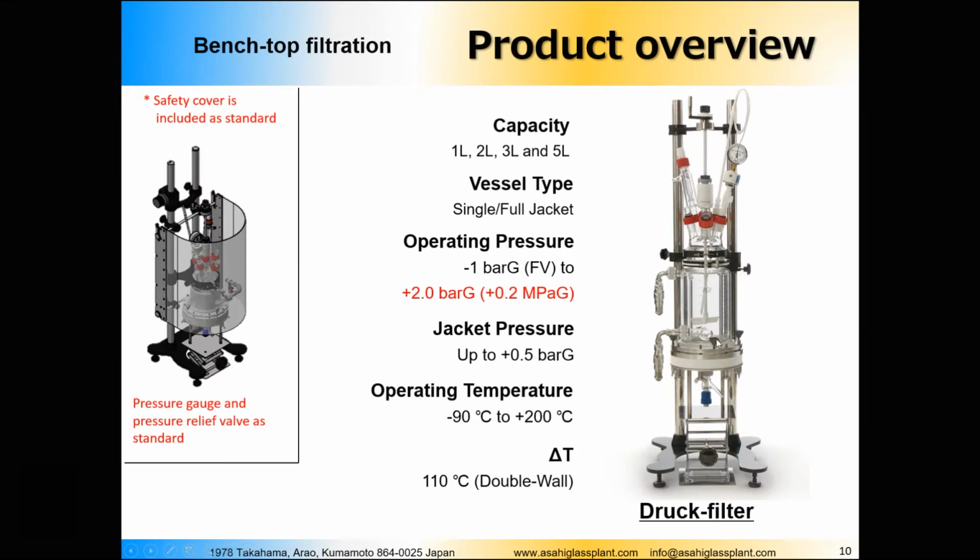First of all, it is not pictured here just because we would like you to see the equipment itself, but the equipment goes with a safety shield, so in case something goes wrong and the unit explodes, it won't explode straight into your eyes.